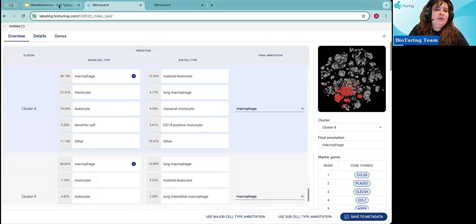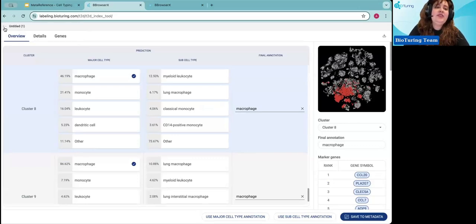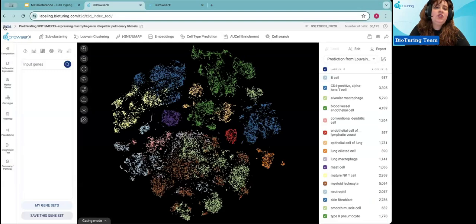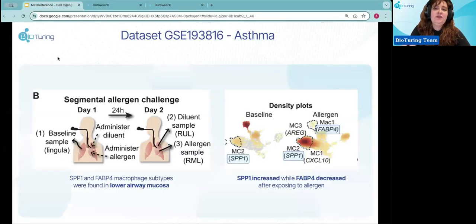Beyond the cell typing tool, the B-Browser X system also supports different visualization tools for directly analyzing cell populations based on gene expression, differential expression analysis, or cell state trajectory analysis. Going back to understand this in the context of the original study, we can replicate these results in the system.